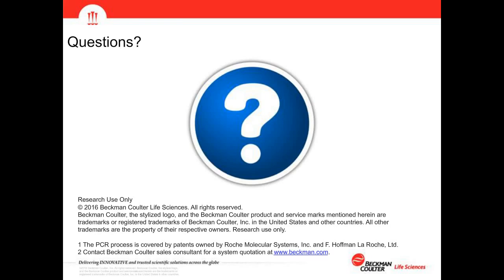And that definitely goes beyond liquid types. We have liquid types. But we can make these pipetting templates specific for any operation if we want, or for any context, such as a volume, such as a sample type, such as a labware type, etc. And it does not require any scripting.